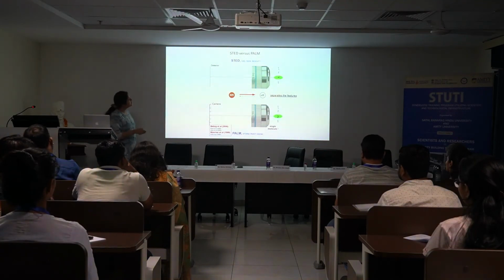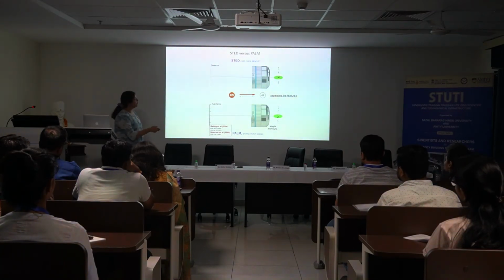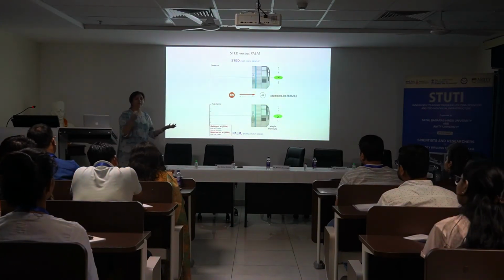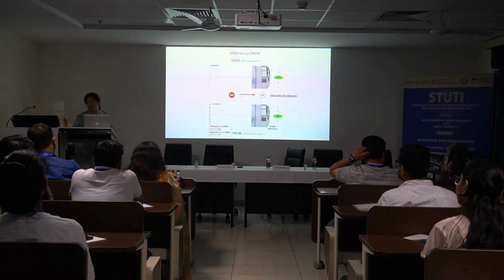Whereas in this case, it just depends upon how well we can achieve that task. So the resolution of this system is slightly more than this system depending upon the sample. But let me remind you that STED is great for a variety of different samples, right? So if one wants improved resolution and we have complicated biological samples, which we often do, then STED is a great method of choice.